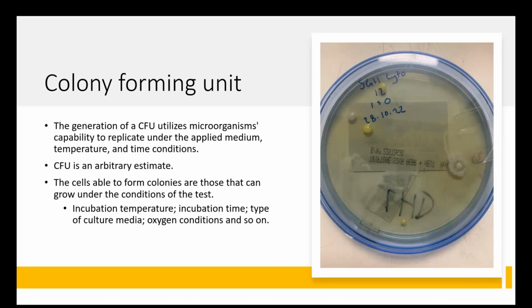But then we have this concept of the colony forming unit. The colony forming unit utilizes a microorganism's capability to replicate on an applied medium under particular temperature and time conditions.